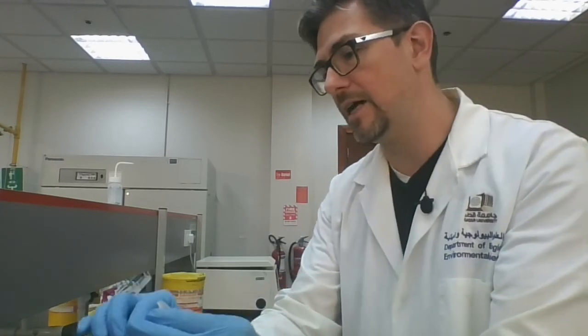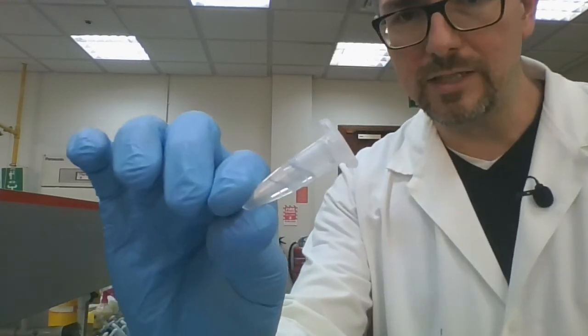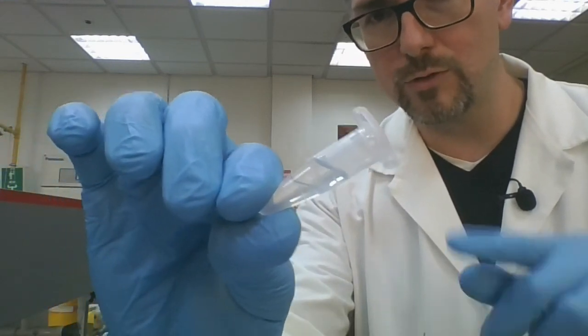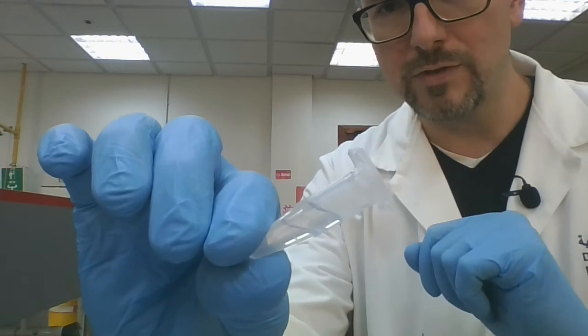Okay, so let's take out our samples. Now, these have been spinning down to separate the aqueous phase from the organic phase, and they were spinning at an angle. So I'm taking it out, and I'm going to try to leave it at the same angle so I don't disturb the solutions from their current position. And I'm going to try to remove the aqueous phase, which is the top layer. I'm going to try to remove as much of it as I can.